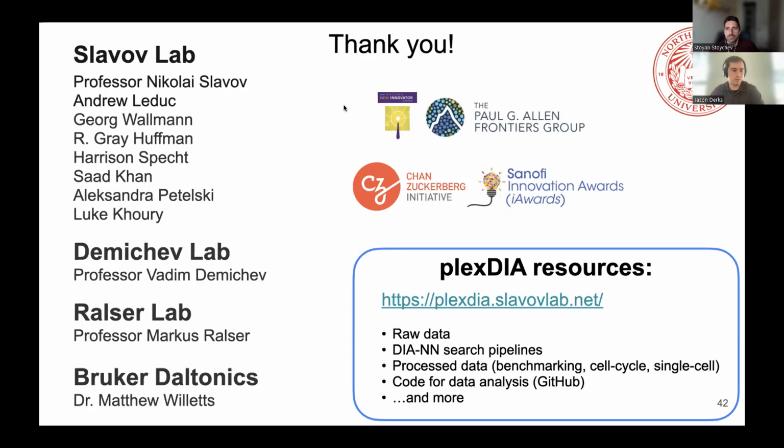We have a protocol for the labeling. It's relatively straightforward, though there are some things that can go wrong, so I can share that protocol. But yes, what we do is the labeling, and then we'll do a shotgun DDA method, and we'll just check really quickly, running a variable mod search, that more than 99% of the precursors that are being identified confidently are labeled fully.